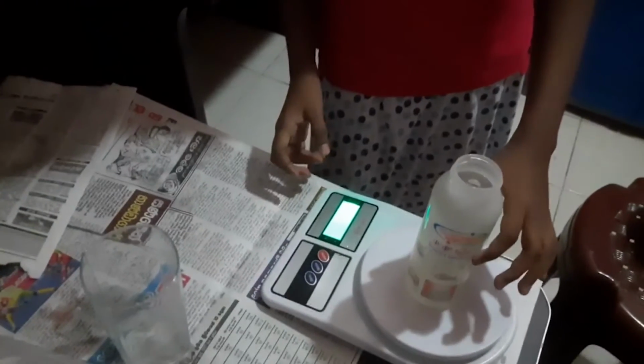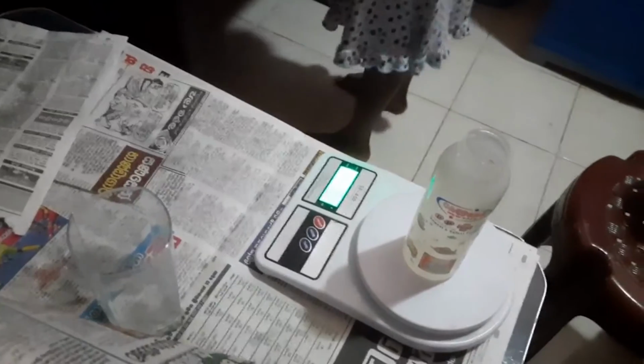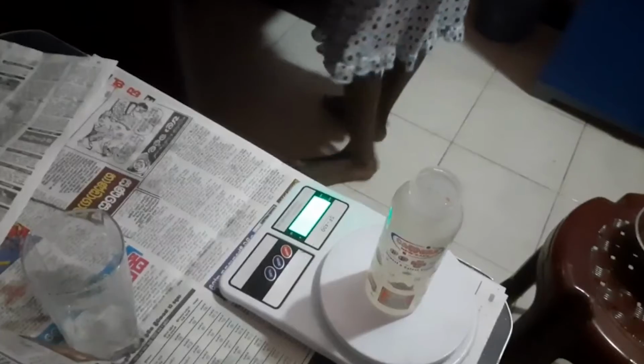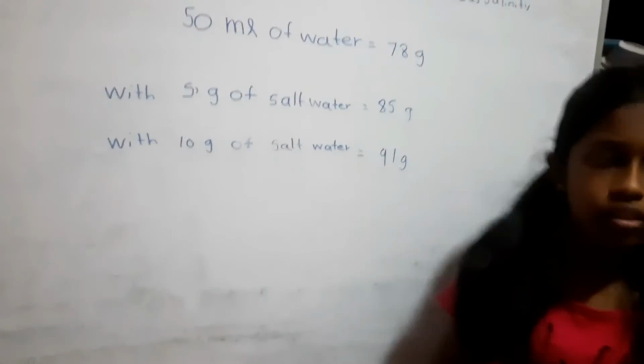And I measure the mass of the solution. 91 grams. So I can observe the water with more dissolved salt has higher mass.